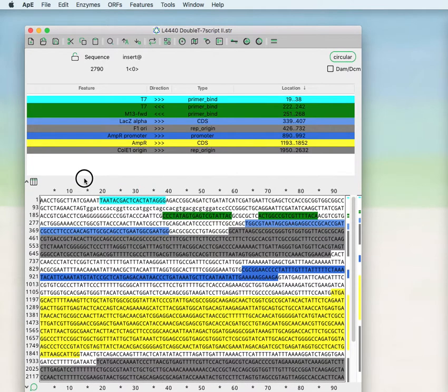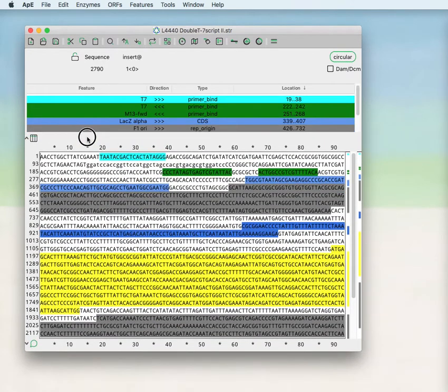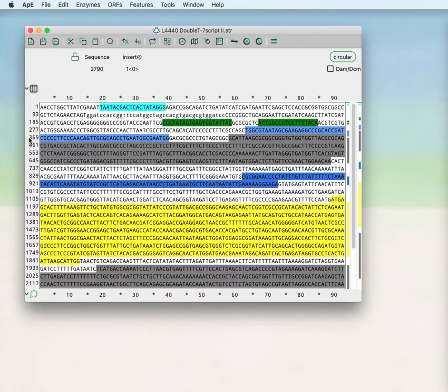You can make this table larger or smaller by dragging here. You can hide this toolbar by clicking here.